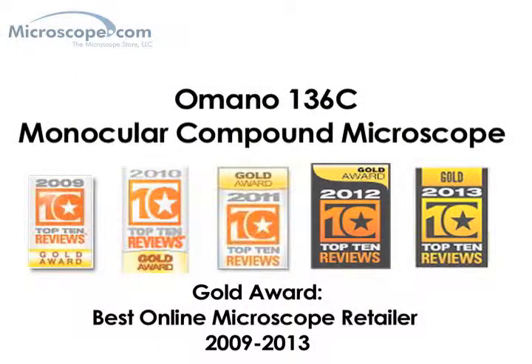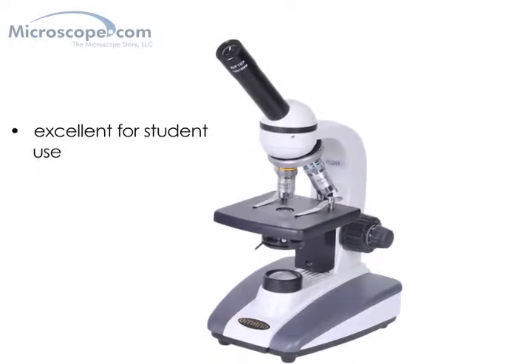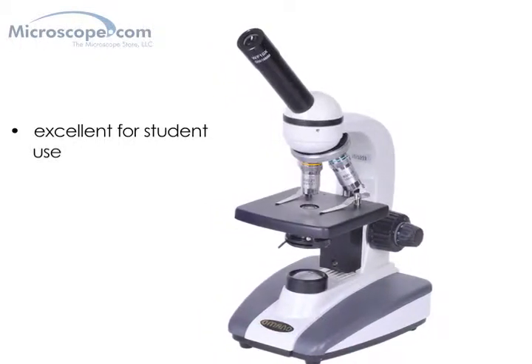The Omano 136C is a well-built, high-quality binocular compound microscope. It makes an excellent student microscope and should provide years of quality service in a classroom setting. This system's features are basic, but its performance is very good.